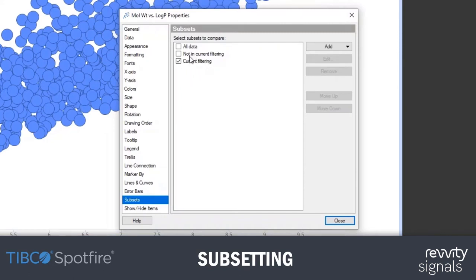Subsets really let you see what slice of data you're currently looking at. The default, like I say, is to show you the current filtering, so as you filter, you'll just see the current filtered rows. But there are other defaults available, and you have options to add additional slices of data based on the marking or filtering schemes or expressions. So let's introduce it with some basics. Let's look at all data.